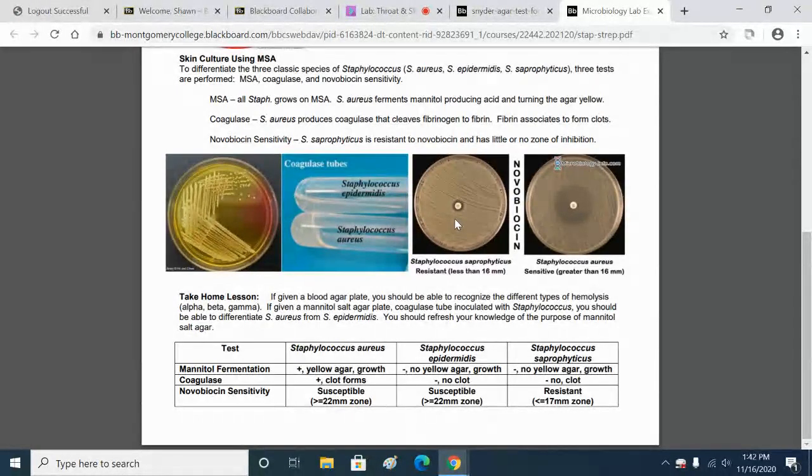I thought about that, but I didn't think it could happen that fast. Oh, really? That fast? But you've had that staph growing on you, so you could have a mutated staph that's been growing on you for years, right? Oh, right. I guess so. Remember the video we watched, the giant agar plate, 11 days, right, for resistance to occur. So it can occur very quickly.